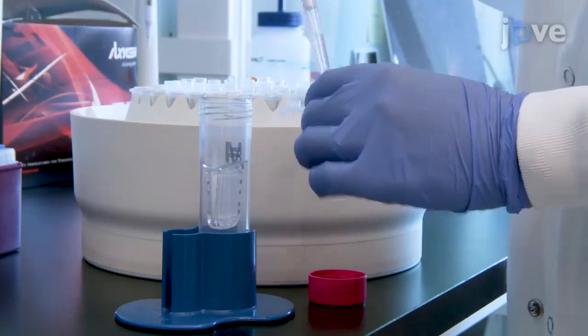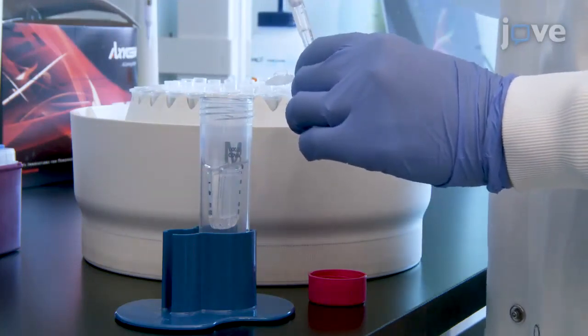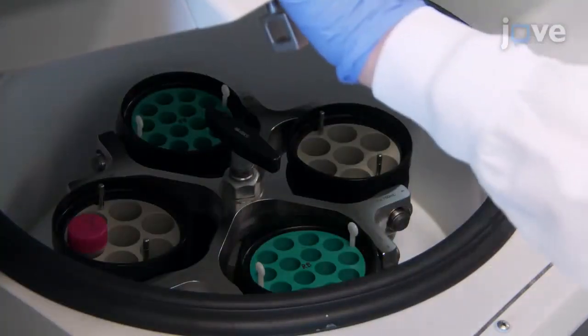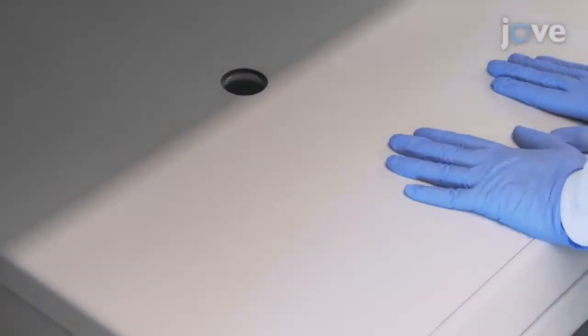Pool the fractions containing the eluted peak in a centrifugal filtration device with a 10 kilodalton nominal molecular weight limit. Then, concentrate by centrifuging at 4,000 times G and 4 degrees Celsius for 15 minutes, or until the sample reaches a volume of 500 microliters.